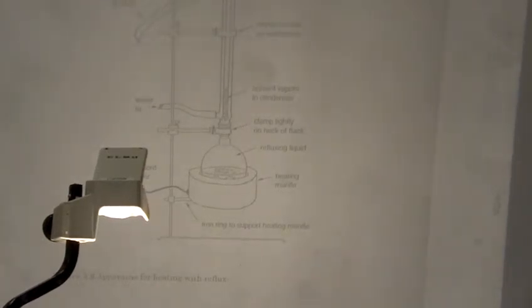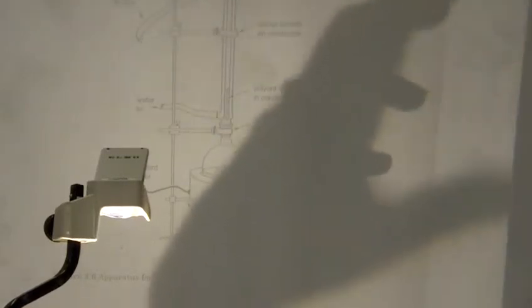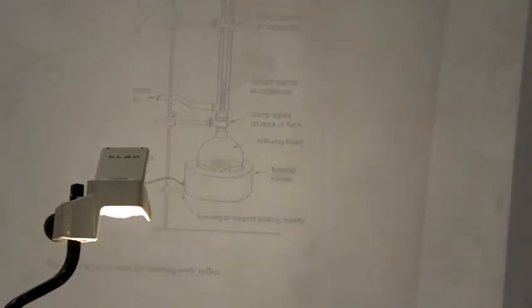So what I would do is work to get to this reflux, okay? Then when you get to this reflux, you can worry about things like dishes and things like that, okay? So don't spend a lot of time up until this point cleaning things and getting things in order until you get to the reflux and have some time to worry about stuff. The other thing is, once you get it refluxing, you need to keep an eye on it, because sometimes it'll take a little bit of heat to get things boiling, and then it doesn't take as much heat, so then you need to adjust the heating mantle afterwards too. So keep an eye on this one, okay?